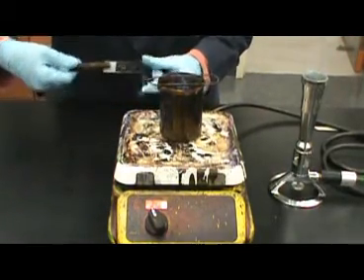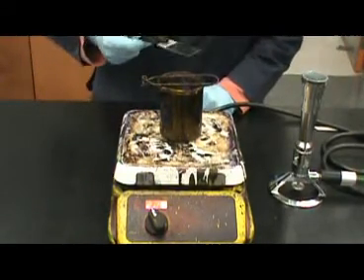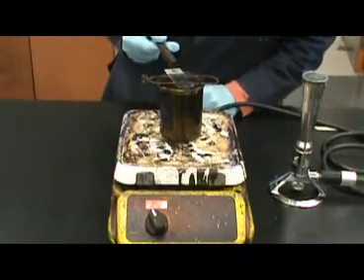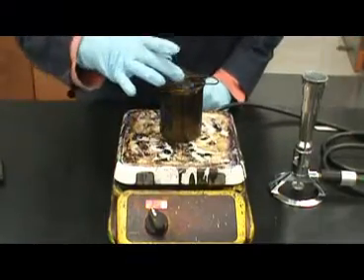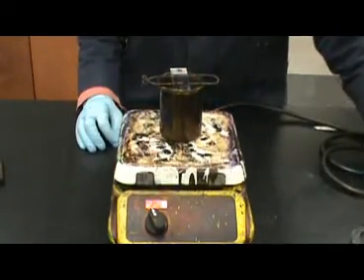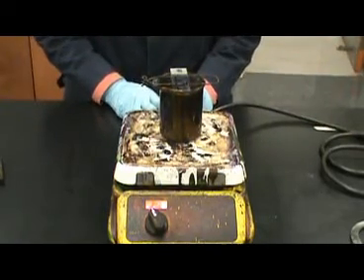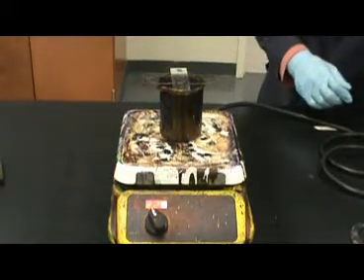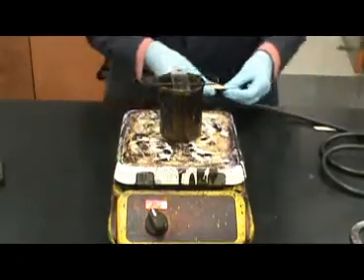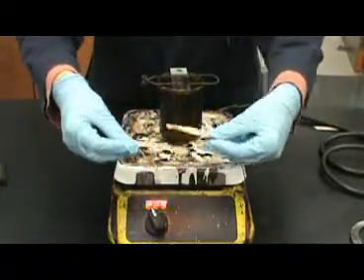After heat fixing, in the Ziehl-Neelsen method, moist heat will be applied. Here, the slide is put over a beaker of steaming water on a hot plate. The steam will loosen up the waxy outer coating of the mycolic acid in the peptidoglycan of the cell wall. This will allow greater penetration of the phenol-containing stain, or primary stain, known as carbol fuchsin.